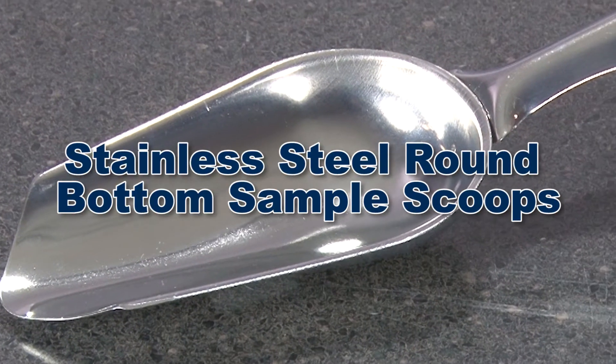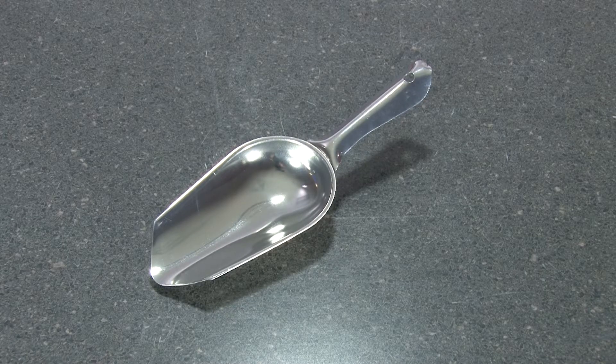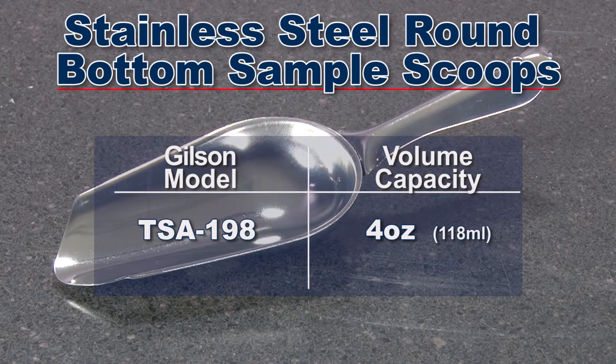The stainless steel round bottom sample scoop is constructed of corrosion-resistant stainless steel. This rugged scoop is useful for lab or field handling of tough sample materials and comes in a 4-ounce volume capacity.